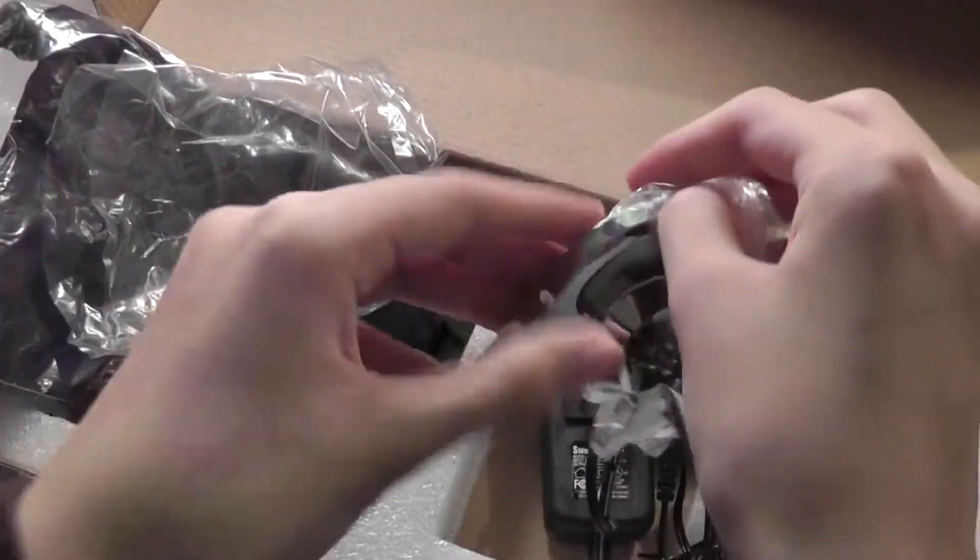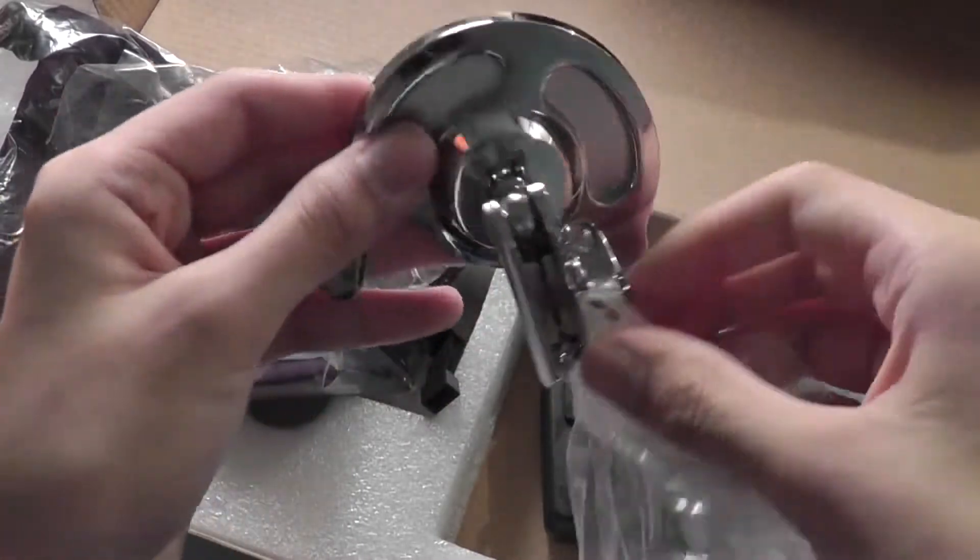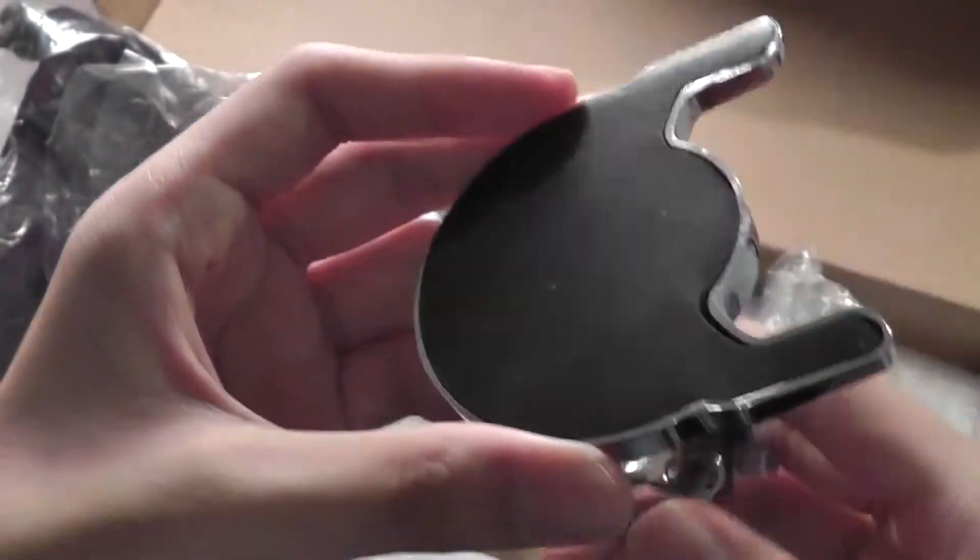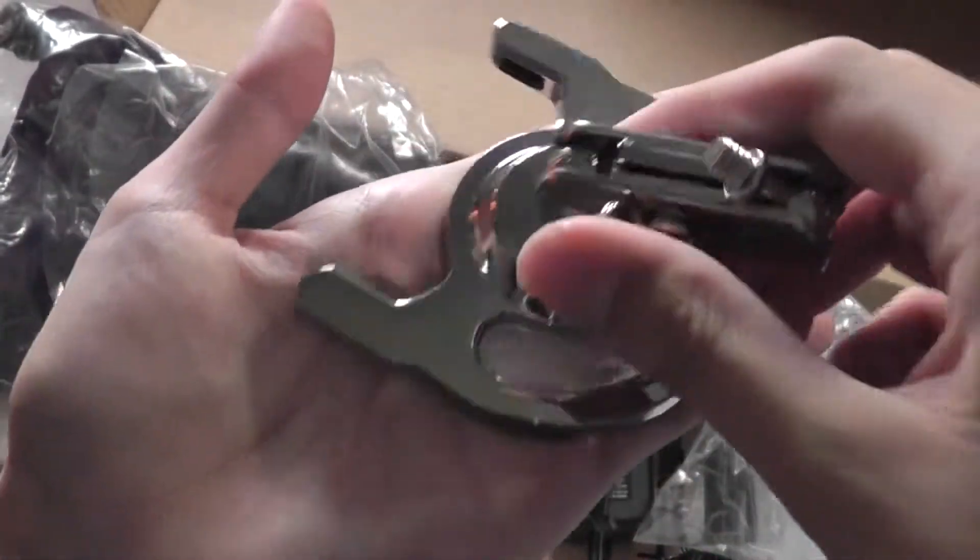It's made entirely out of metal and chrome, so it's going to be a bit of a fingerprint magnet, but it has a nice hefty weight and also a rubber stamp on the back which prevents any sliding around or scratches on any surfaces.